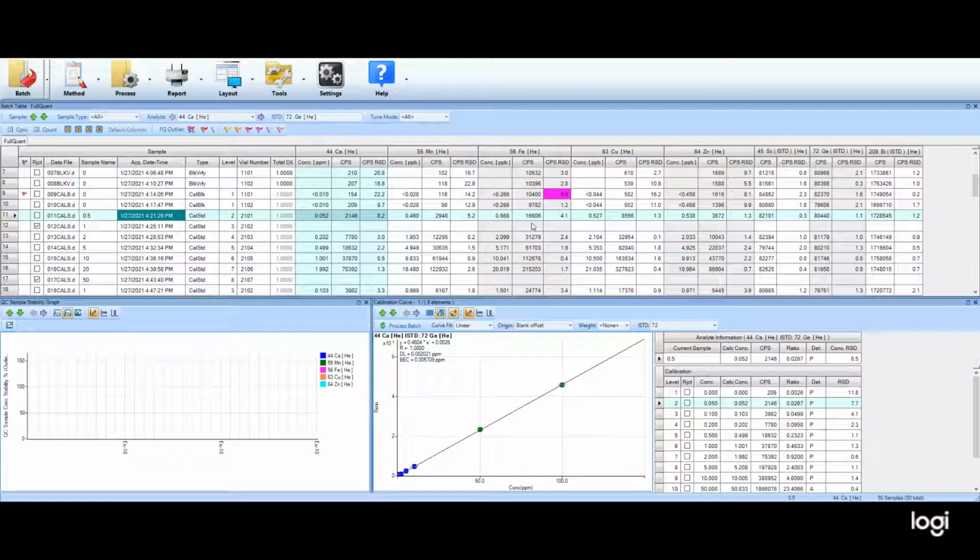Okay, I want to go over some MassHunter basics, the data analysis method that we are using right here. What I'm showing on this screen is just the regular MassHunter data analysis screen that we see even as we collect data.